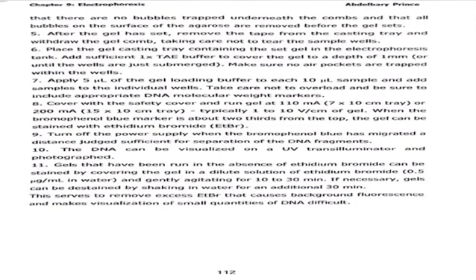5. After the gel has set, remove the tape from the casting tray and withdraw the gel comb, taking care not to tear the sample wells. 6. Place the gel casting tray containing the set gel in the electrophoresis tank. Add sufficient 1x TAE buffer to cover the gel to a depth of 1 millimeter, or until the wells are just submerged. Make sure no air pockets are trapped within the wells.